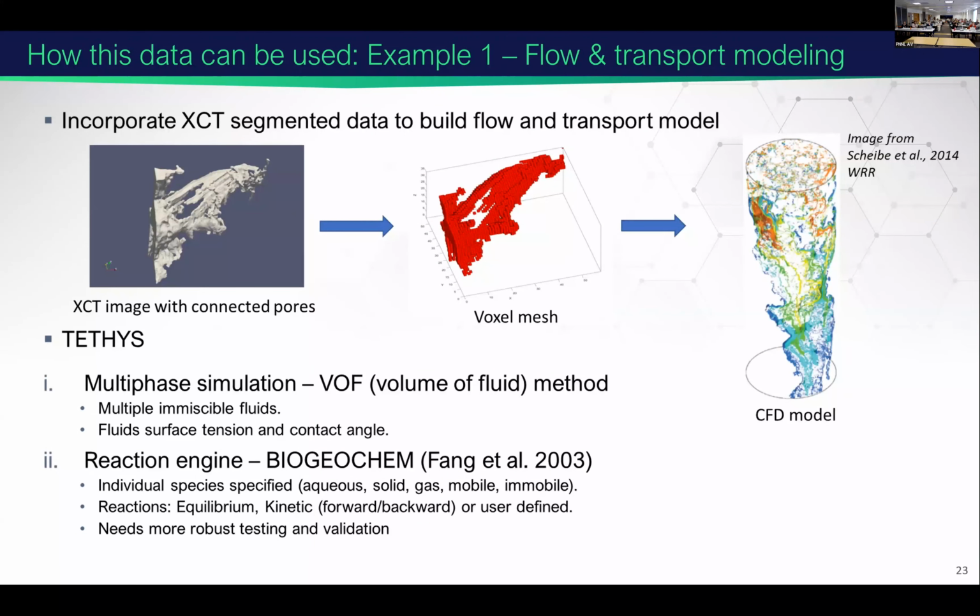One I showed before in the other presentation: basically the direct use of the exported 3D segmented pore space or pore data into a voxel mesh to be used in computational fluid dynamics simulations that can simulate the flow of multiple fluids actually, and can be very useful for understanding biogeochemical reactions and processes.